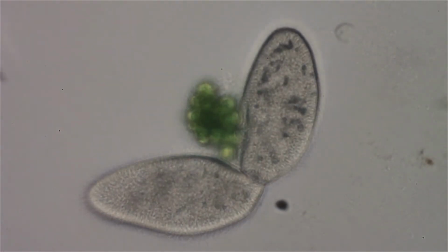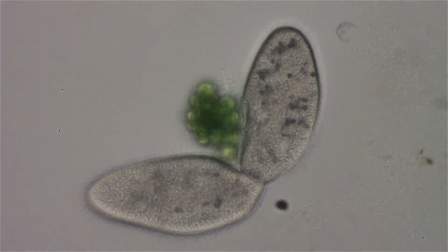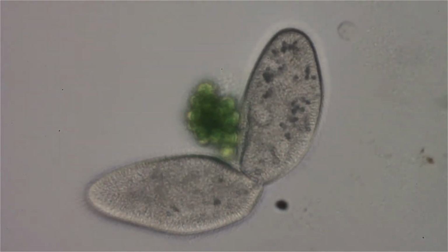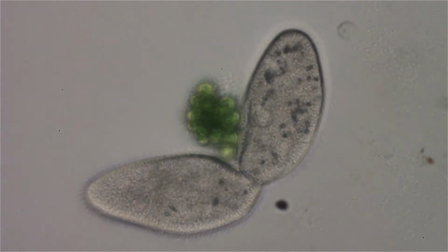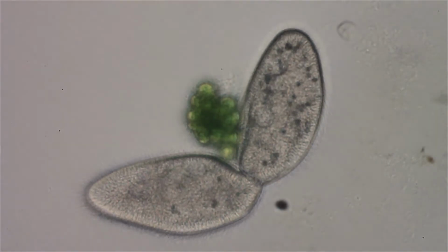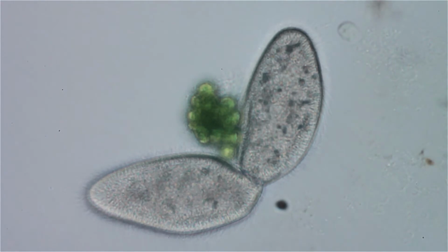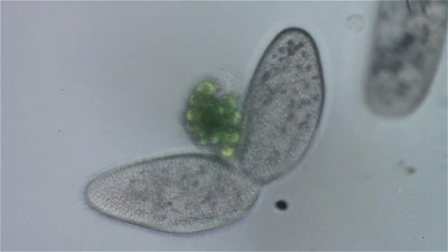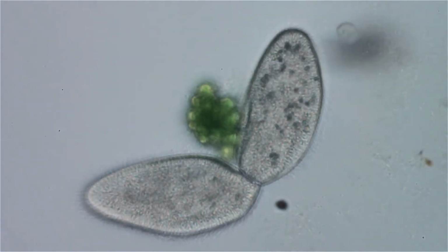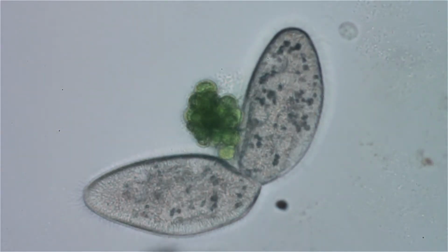Apparently that's because the Fluophot phase condenser in the bright field position only has a rudimentary iris in it. There's no way to really adjust the amount of light going through it with any accuracy. However, moving it up and down does work. And you see a big sensor dust spot there below him that I didn't notice till I started recording.